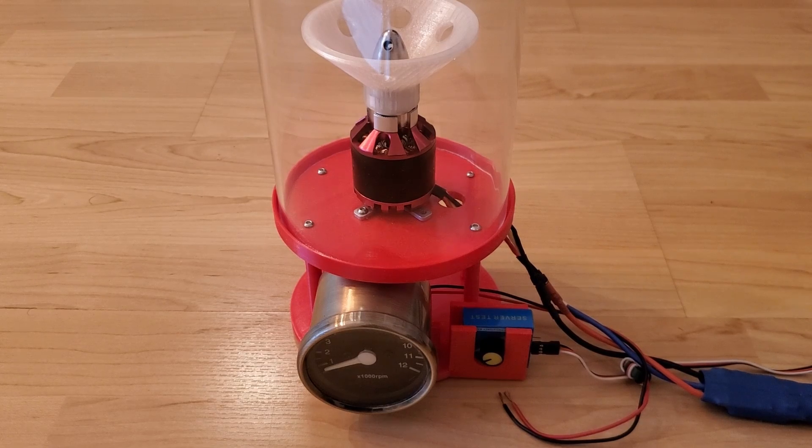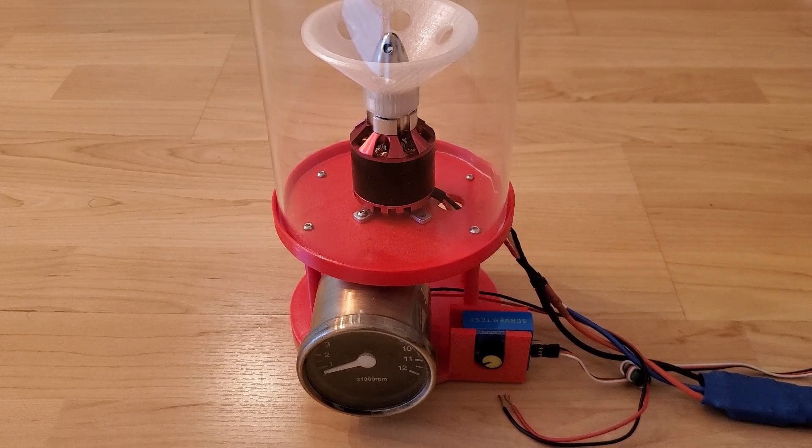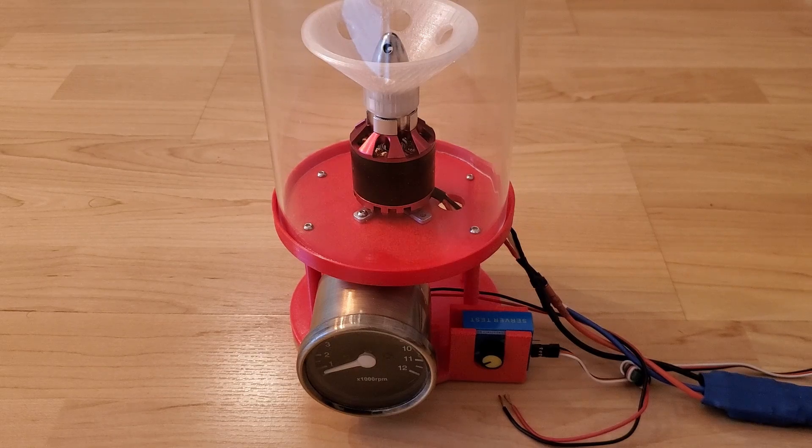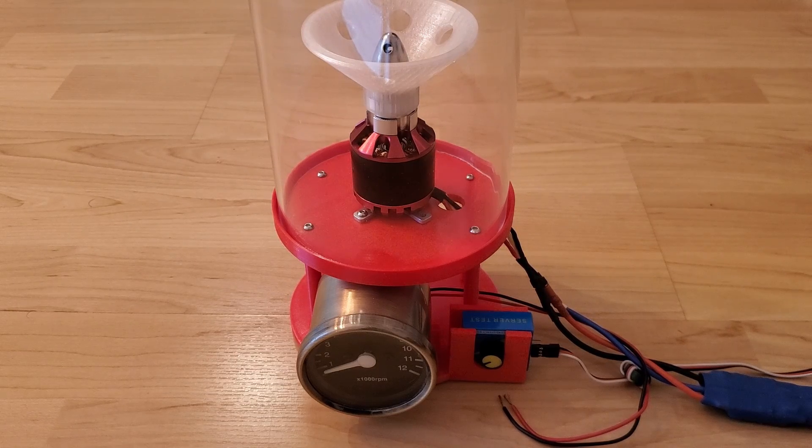And that's it. The Speedo centrifuge v2. If you'd like to try making your own I've added a printables link in the video description and if you have any suggestions or like the project feel free to comment that below. Thanks.